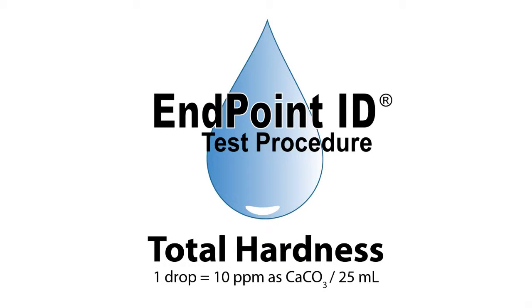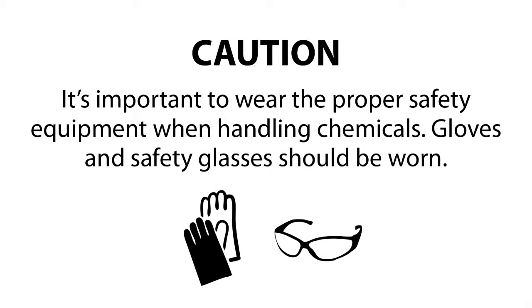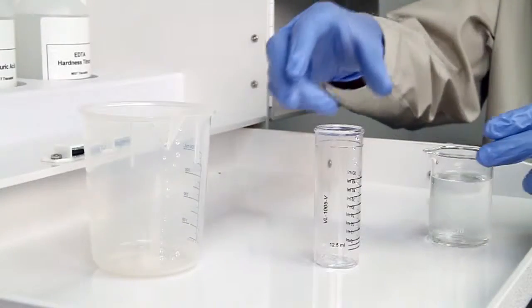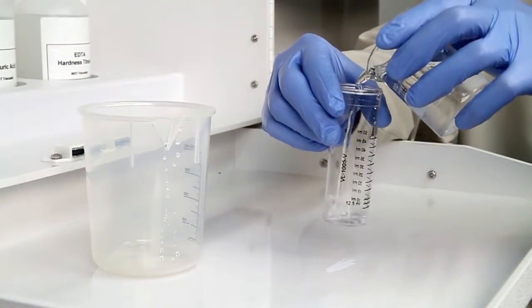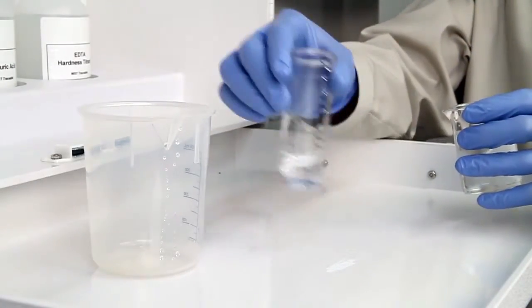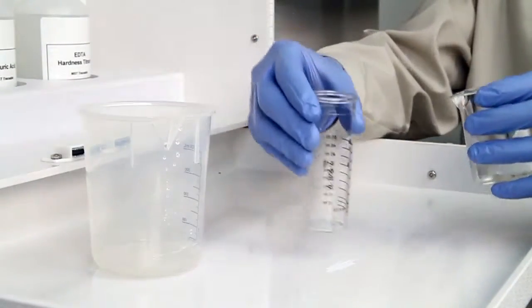This is a demonstration of a total hardness drop count test kit using Endpoint ID procedures. The first step is to collect an accurate sample. The smallest change in sample size will lead to inaccurate results.